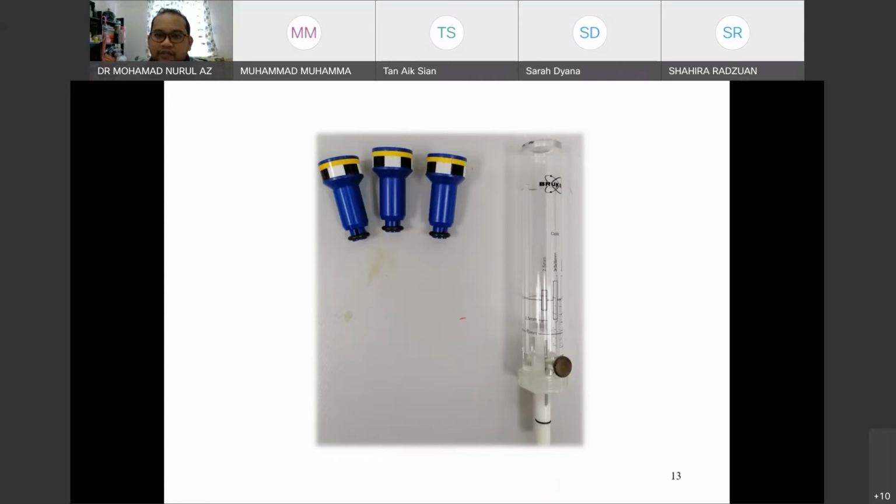Okay, please be careful with your own samples. Don't say you don't know.